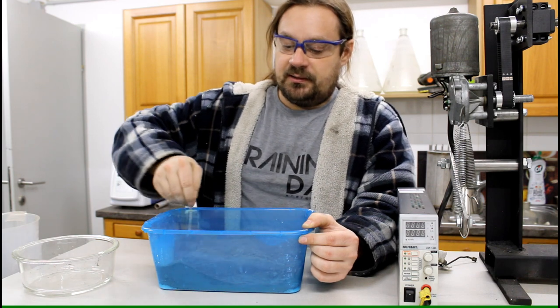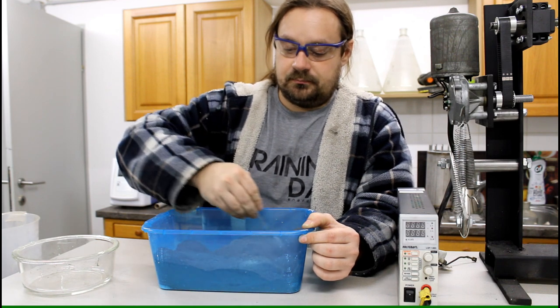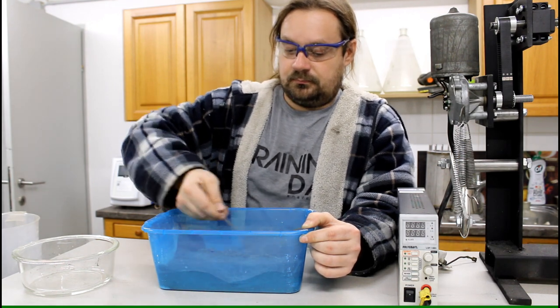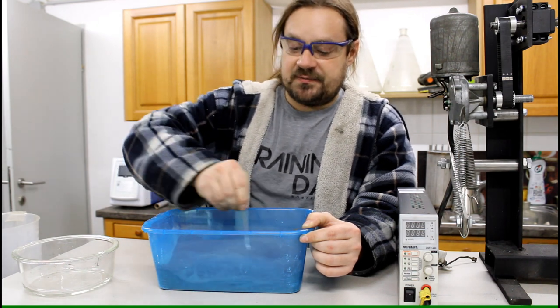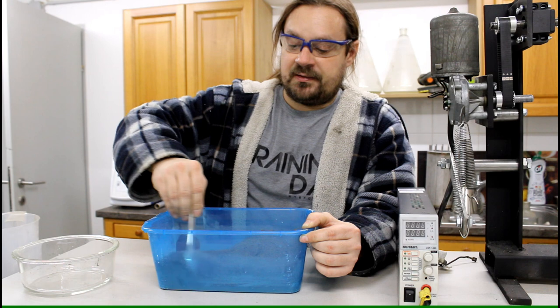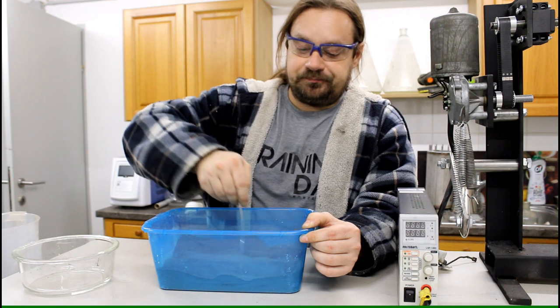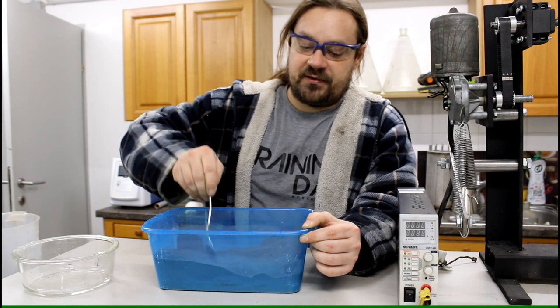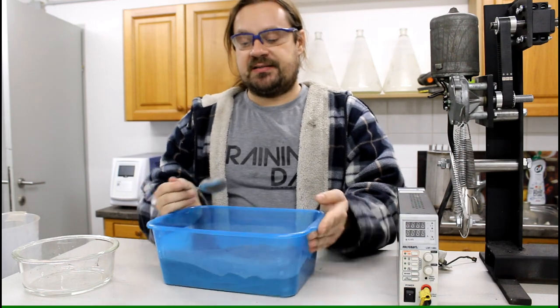Till it is mixed. The finer the powder is, the better it is, because the finer it is, the more surface area it has, so the extraction will be more complete. So it's very good to just grind it really a couple of days till it is a very fine powder. Okay, mixing step is finished.